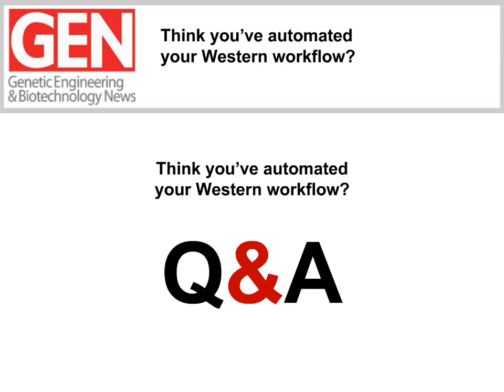Andrea, a listener wants to know, can I multiplex with Simple Western? Yes, you can multiplex so long as the proteins are of distinct molecular weight. Because this is a chemiluminescent detection, if the proteins co-migrate, you're not going to be able to distinguish them. But if you can separate them, you can definitely multiplex. Internally, we've multiplexed up to 4 or 5 proteins at a given time. You just need to ensure that your antibodies all have pretty clean background in order to do the multiplexing.